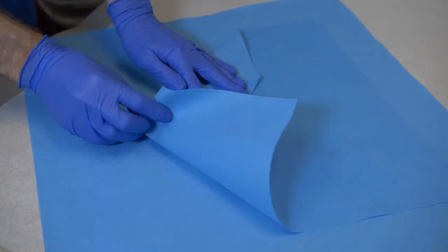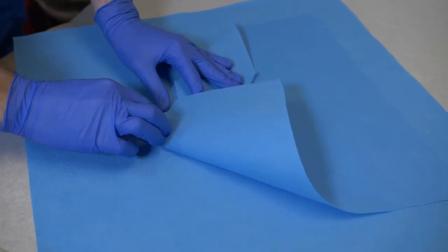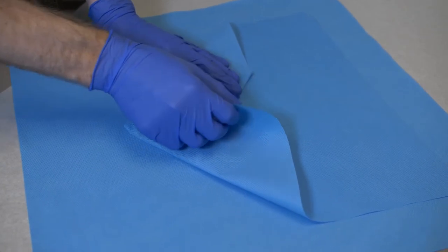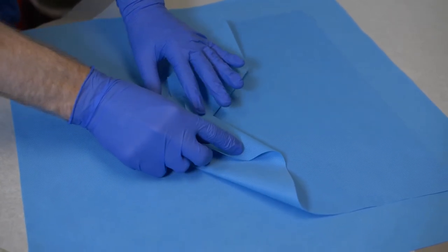Fold one side edge toward the center line and fan fold back to the side and crease it as before. Repeat this step for the other side edge.